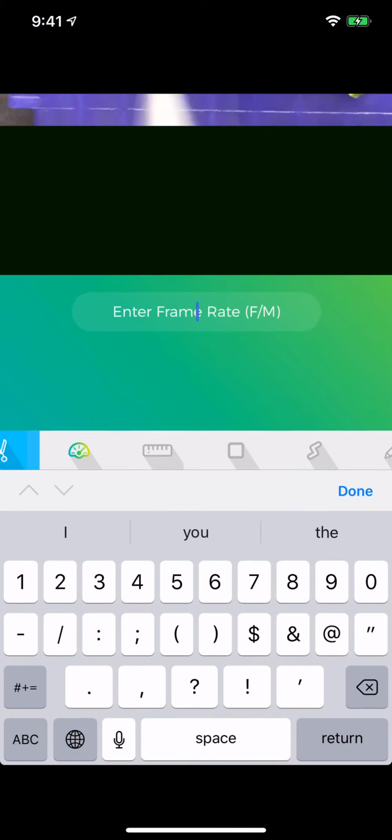Tap Next. Now you're going to enter the frame rate, the frame rate you actually set in Lapse It. It's important for gravitropism using this system to take a movie every 2 minutes. So if we enter that, the frame rate would be 0.5.